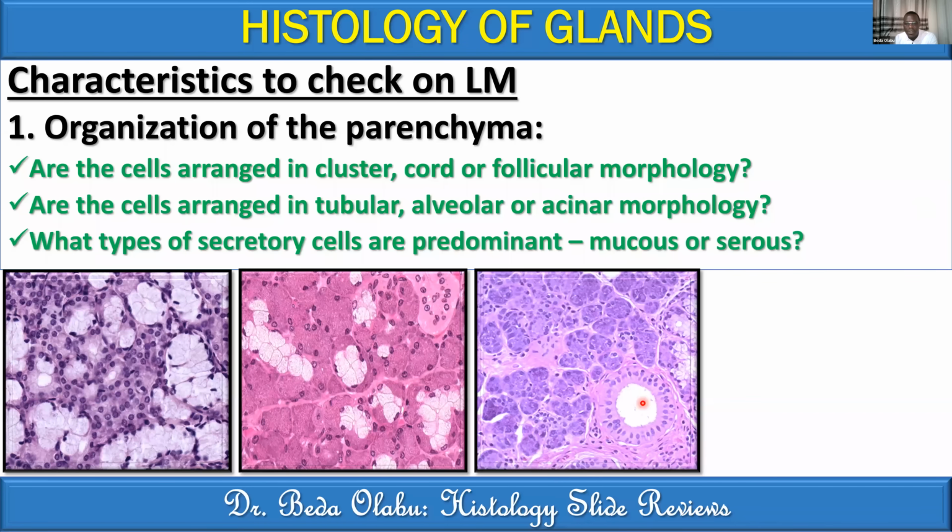What is this structure called? All right, good. I've closed it. A good number have gotten it, but still a good number are lost.